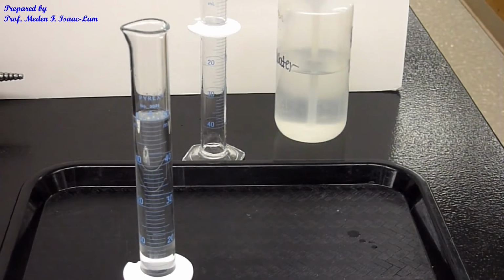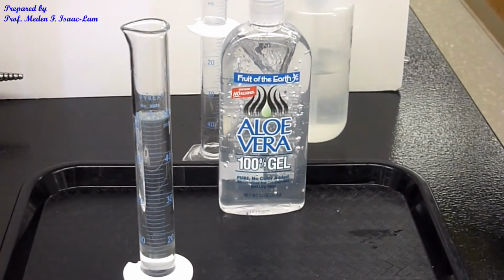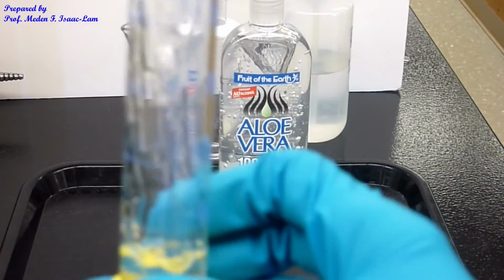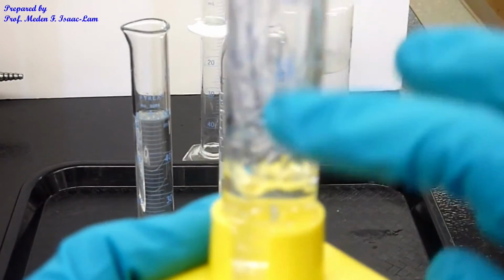So again, this is the aloe vera gel, and because it's a gel, it was difficult to measure. So I have here a cylinder, and I measured about 7 ml. It's actually sticking to the side.